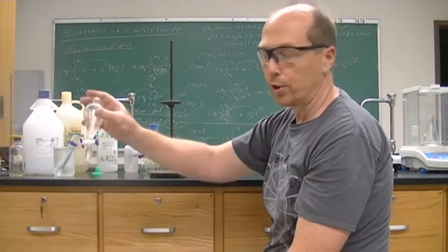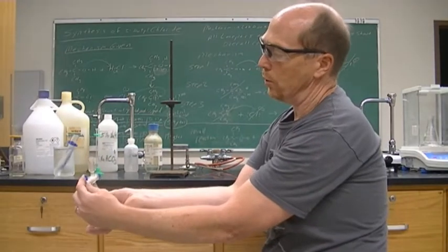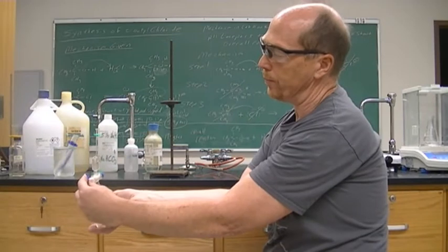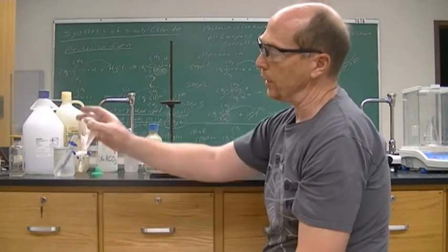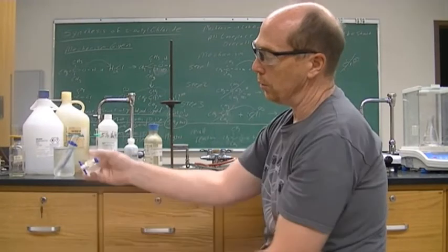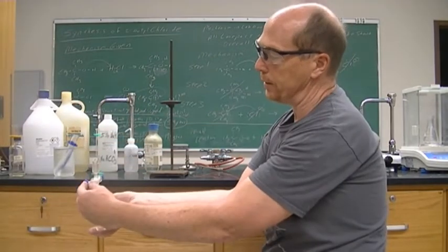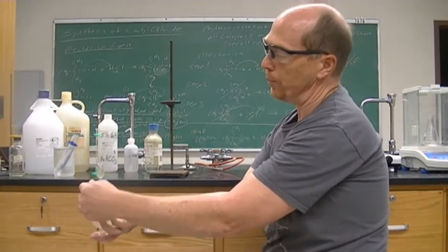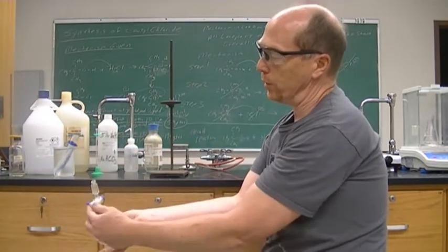There's no ether or any alcohol, but there is a reaction going on, and this reaction is exothermic, and we're also warming up our cold hydrochloric acid, and so that is releasing some pressure as well. So as it is heating up, it's going to build up pressure.